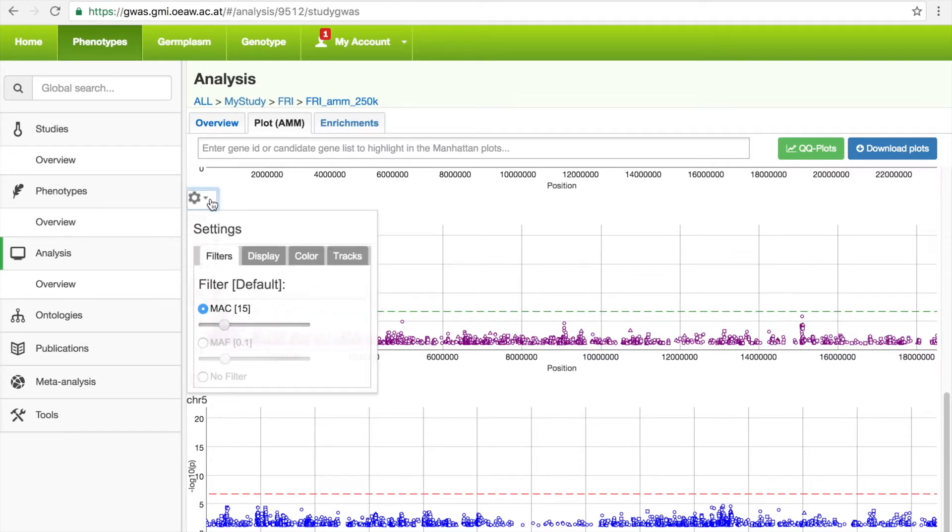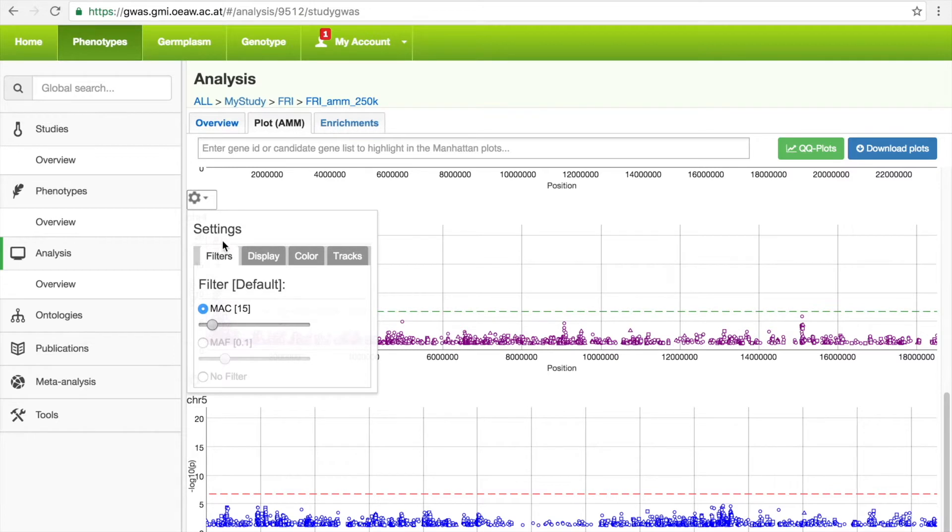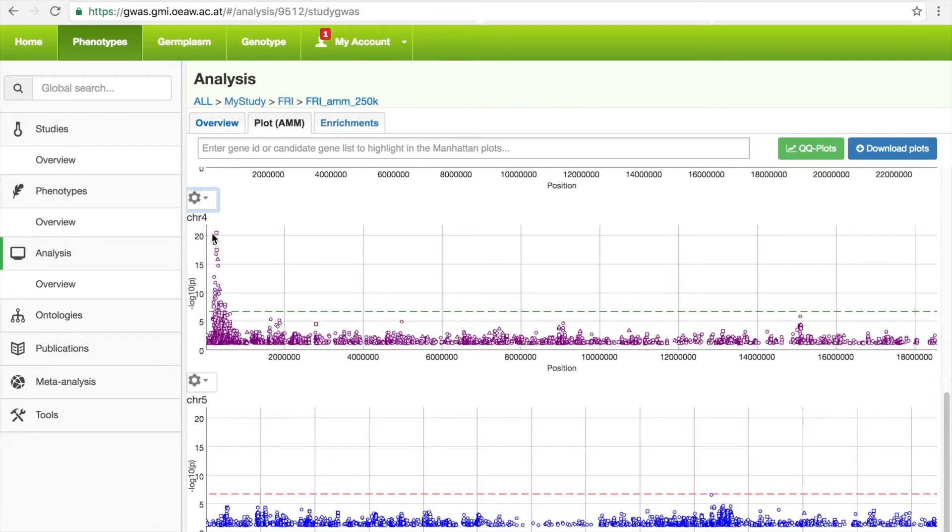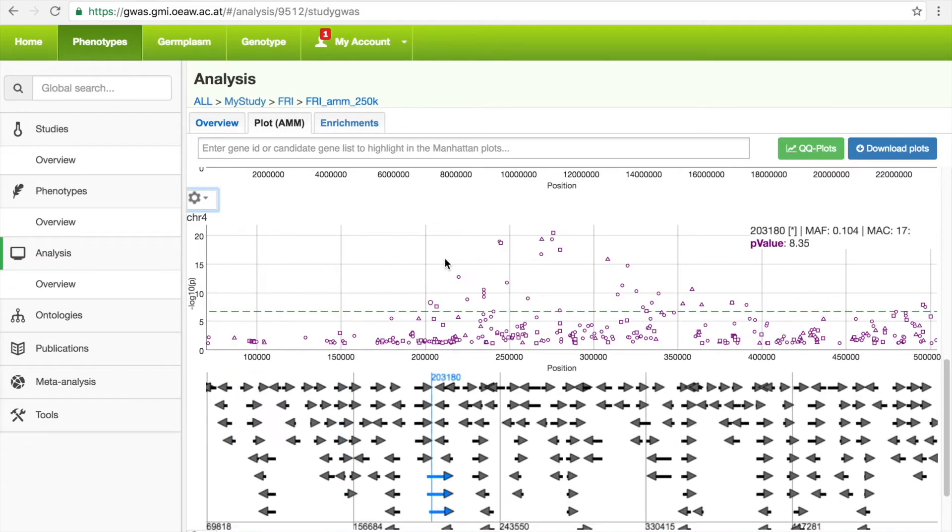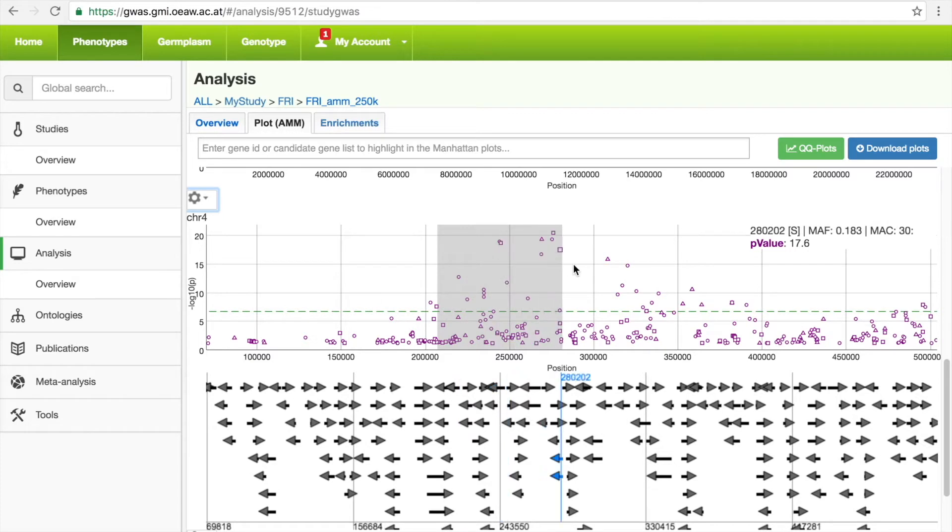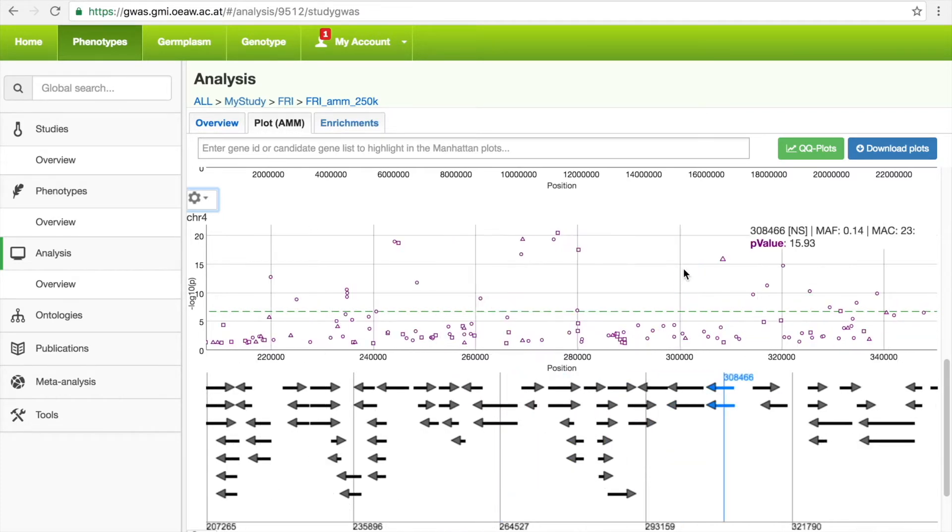For example, by changing the minor allele count threshold, or displaying only synonymous or non-synonymous SNPs. However, the real goal is to find the underlying genes responsible for the phenotype. So, zooming into the Manhattan plot will lead to the display of a gene annotation track underneath. If you mouse over any region, a blue line will appear underneath.